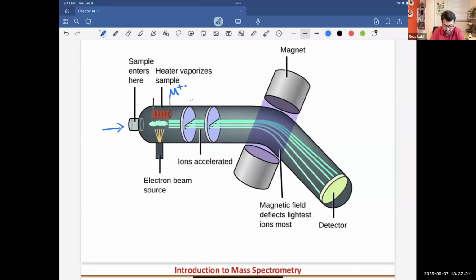If I put a negative charge on those plates, I can actually attract, or pull, that species to the right side. And very soon my particle will move, and because it's in a gas phase and there is also a vacuum, the speed is going to be really, really high. Now, when the particle starts moving, it's going to have a magnetic field.